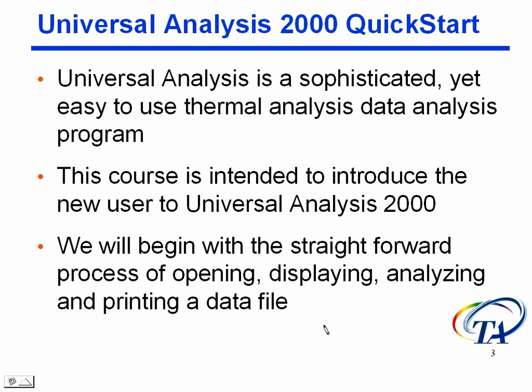Okay, now we're going to begin with the straightforward process of opening, displaying, analyzing, and printing a data file. We're going to keep it nice and simple. Just do the 1, 2, 3, 4 bit, and I'll show you what you have to go through. It's really not that complicated at all.